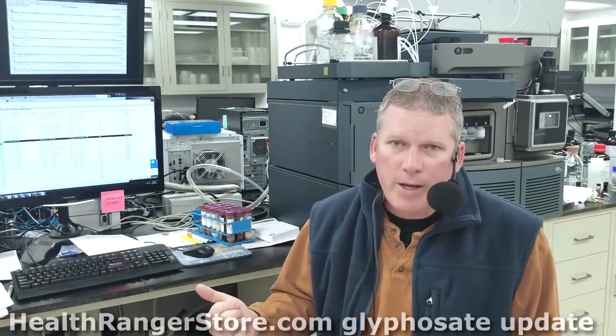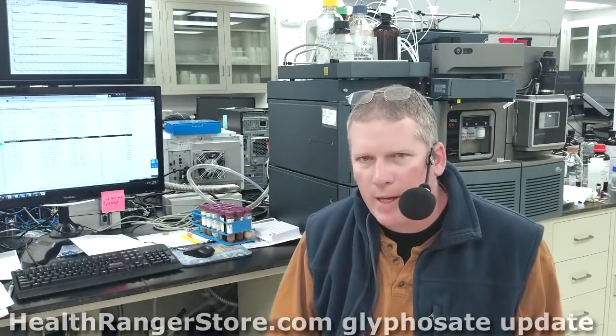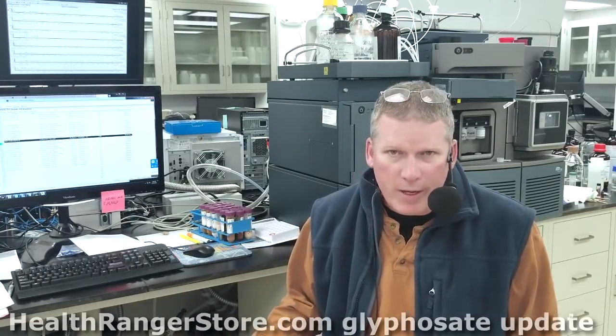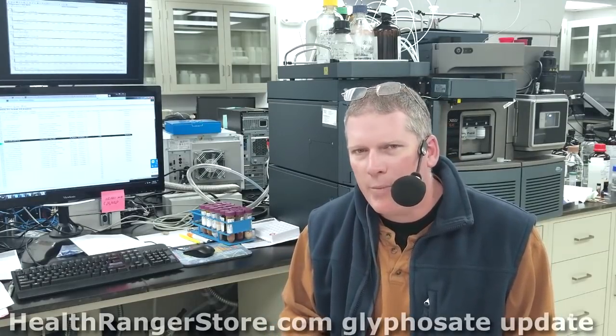We test everything for heavy metals. You probably already know that. We have an inductively coupled plasma instrument right over there. I've done videos with that instrument if you want to see that. That's inorganic chemistry, and it's got a plasma torch on it. It's pretty interesting. But we also test for microbiology. That's actually a very simple instrument: an incubation chamber, with vials preloaded with exactly the right media to test for E. coli, salmonella, things like that.